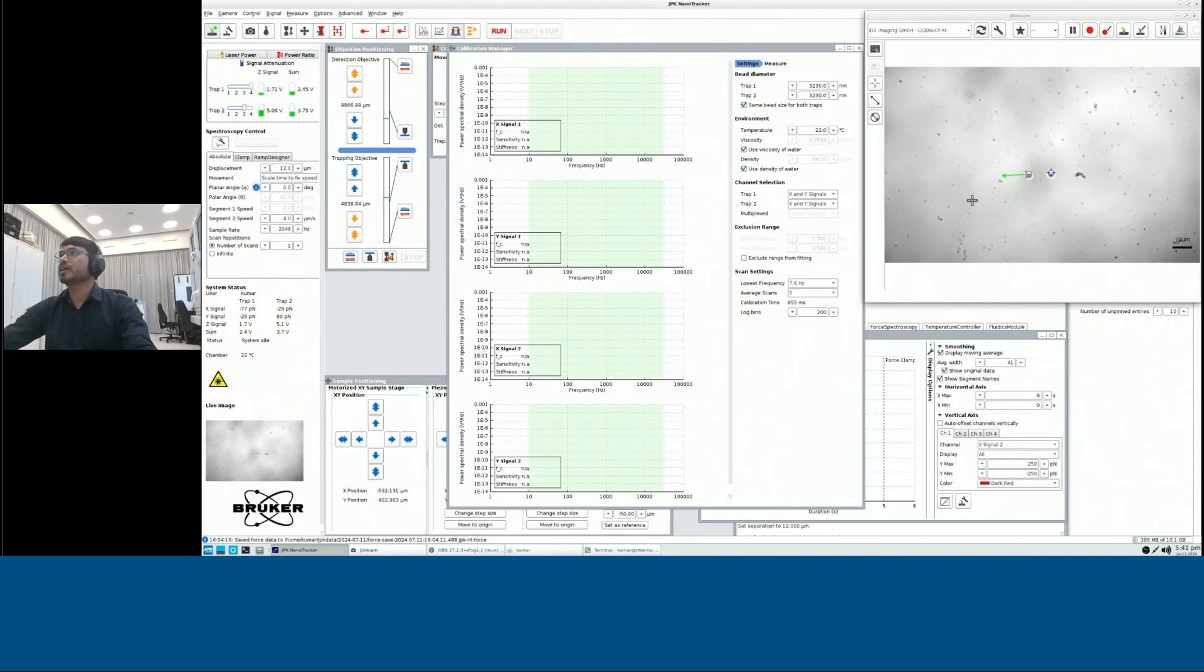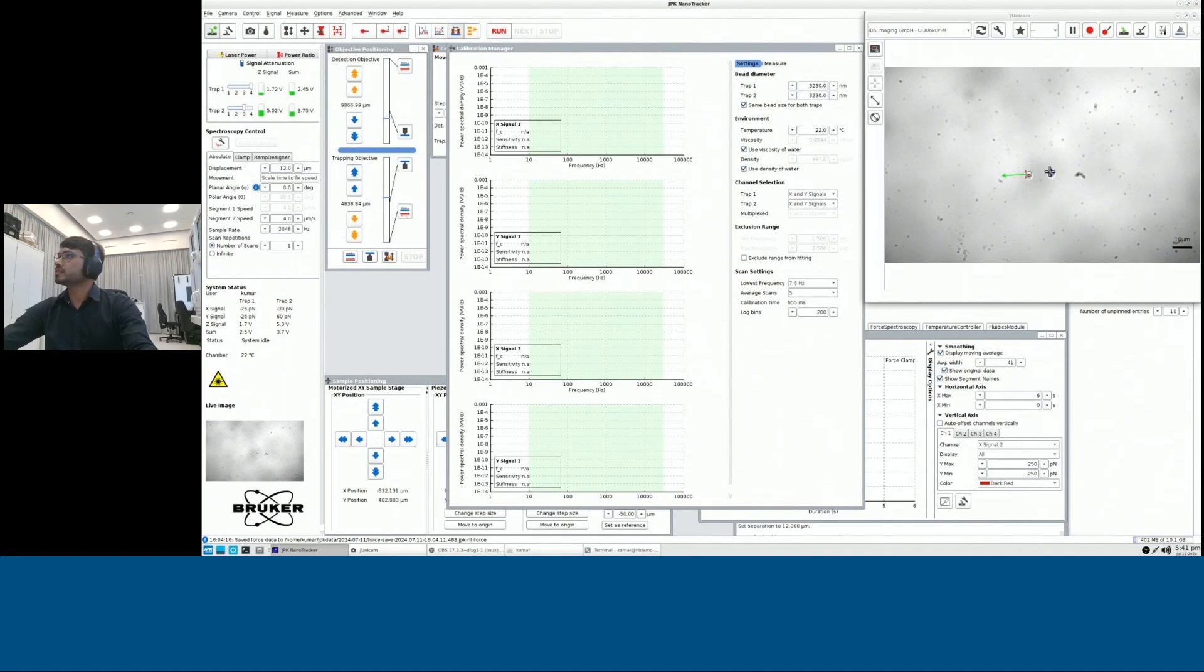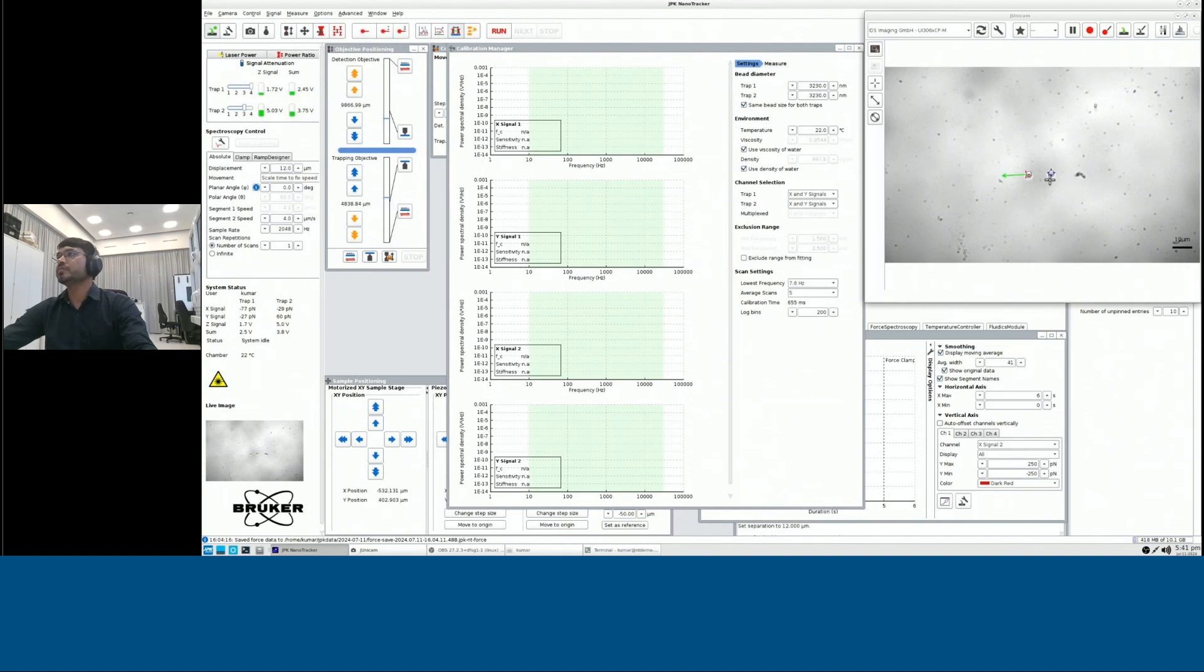So here on the right hand side, you could see in the camera that two particles are trapped. Let's say this is trap two and we call it trap one. Trap two here is a static trap and I will move trap one and then record the forces.